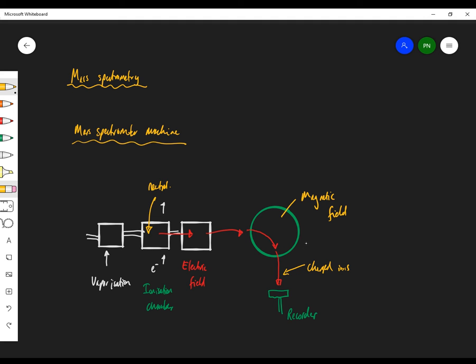What happens in my ionization chamber as well? Well, a couple of things. They get ionized, but also in this chamber, we break them apart and we say they fragment here. When they fragment, let's have a look at something simple. Let's have a look at this guy. This is ethane. Let's smash it in the middle, smash it here. If you just smash it like that, you'll end up with two bits.